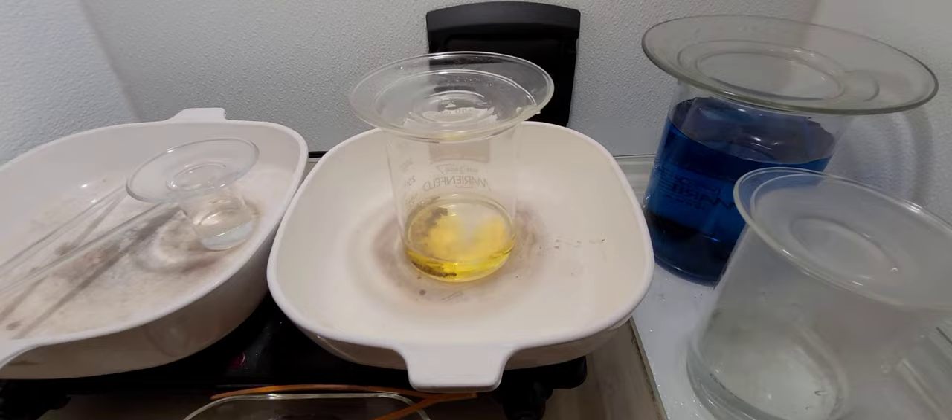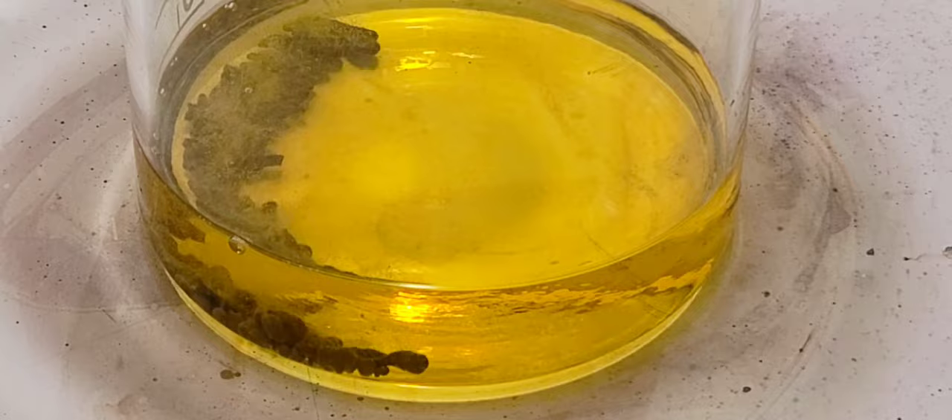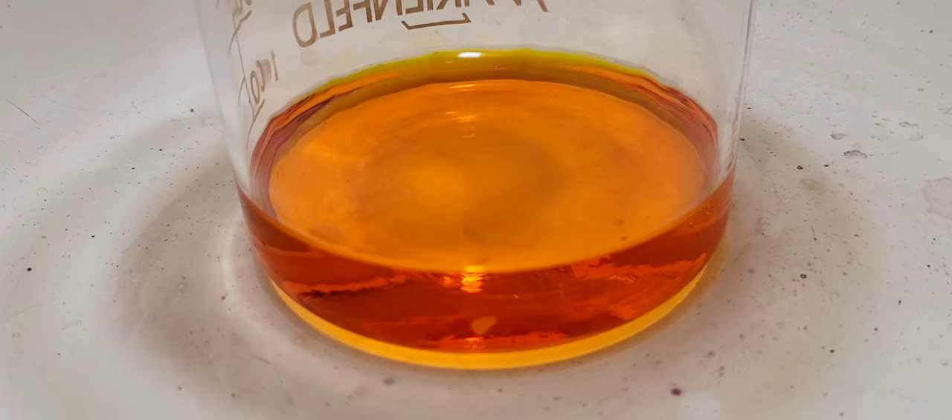We're going to add some hydrochloric acid and nitric acid, and we're going to dissolve this material and put it into solution. This hydrochloric acid and nitric acid makes up a concoction we call aqua regia, and that is what we use to put gold into solution. Here it is — you can see the solution is getting a bit more rich, a heavier color. There might still be some trace impurities in there that we're looking at.